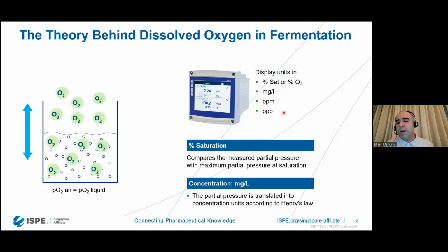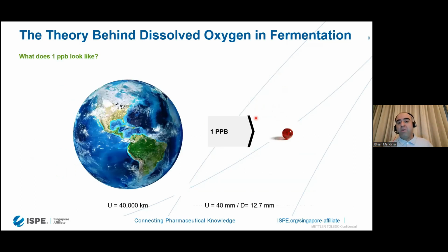It's rare to be measuring all the way down to ppb, for example in finished product in breweries, or in power plants where the water that is the coolant in the cycle must not have even a few ppbs. We do not want even 1 or 2 ppbs of dissolved oxygen. Then we are, of course, able to have the precision and report that precisely.